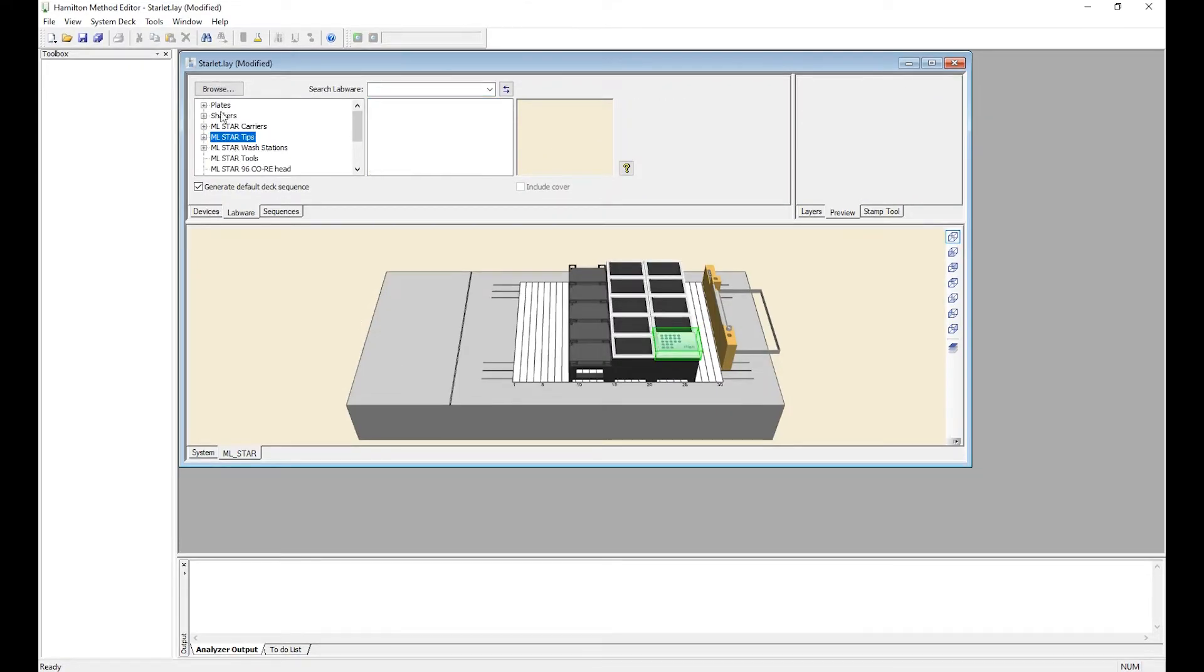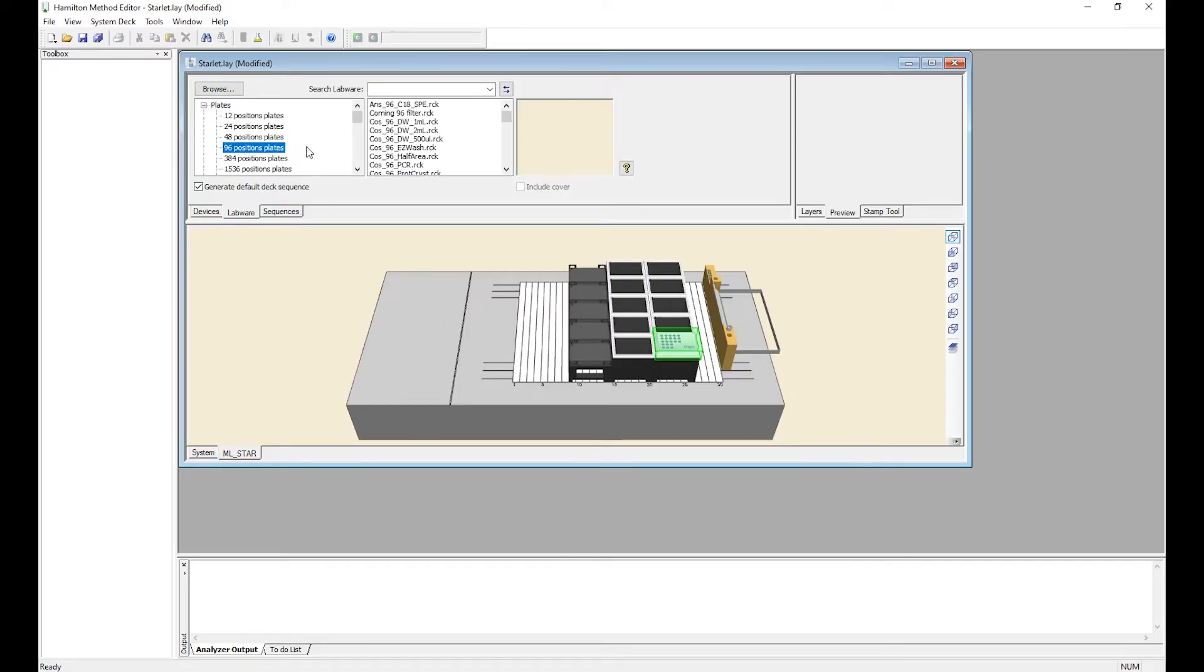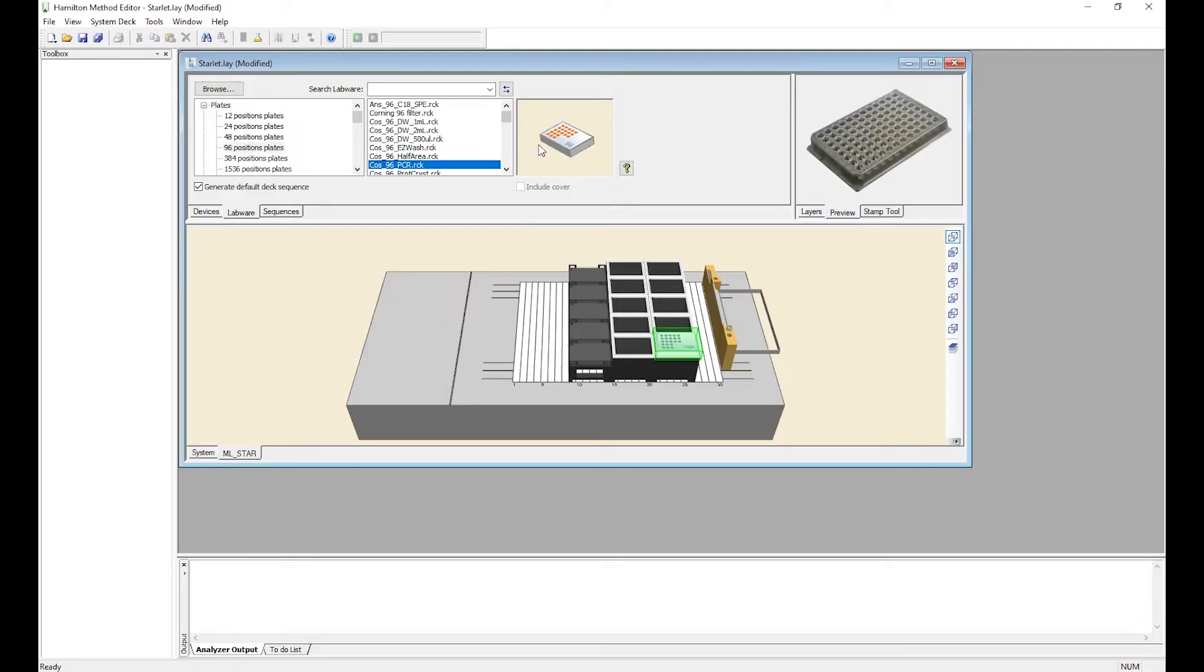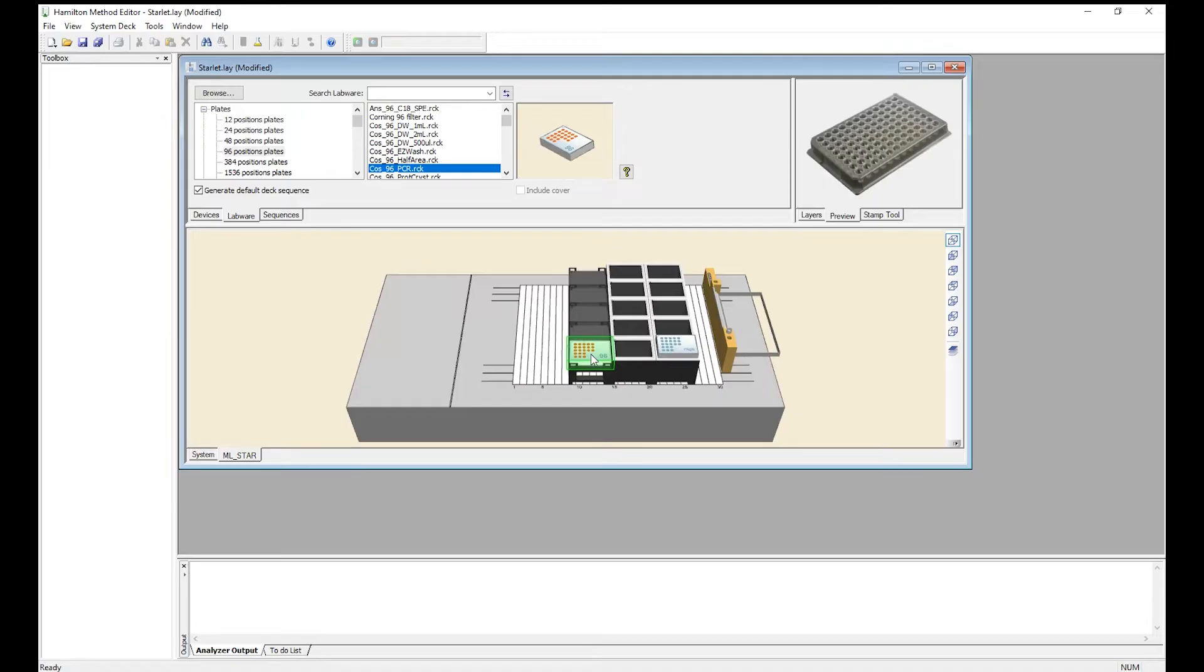Next we're going to add our plates and reservoirs to the deck. Go to Plates, 96 position plates, and select the plate you want to use. For today we're going to use the 96 PCR rack. Drag it to the position that it's in.